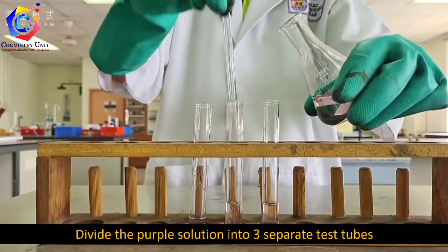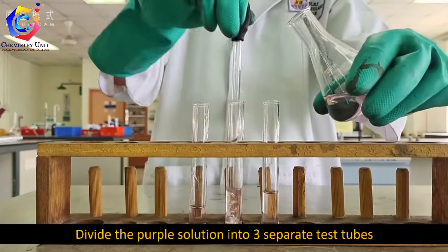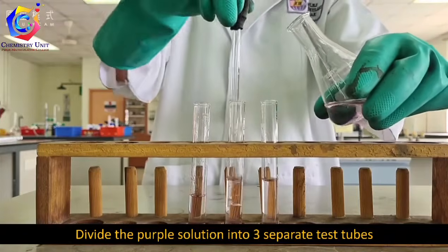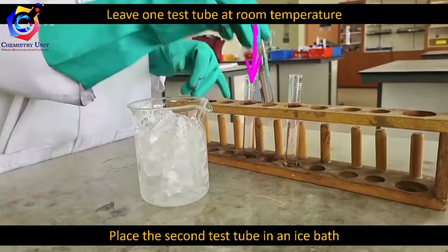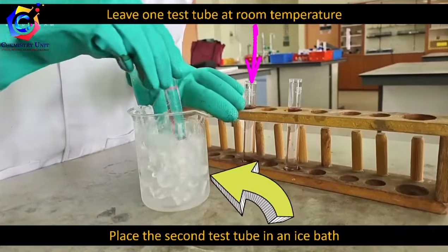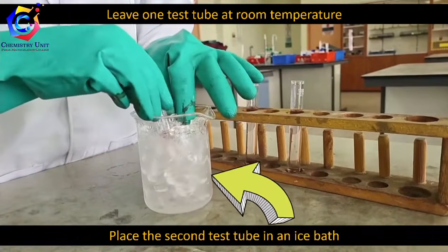Divide the purple solution into 3 separate test tubes. Place the second test tube into an ice bath. Leave one test tube at room temperature.